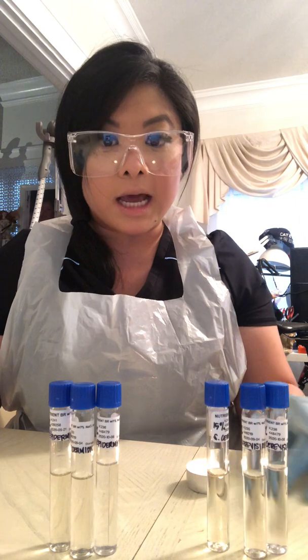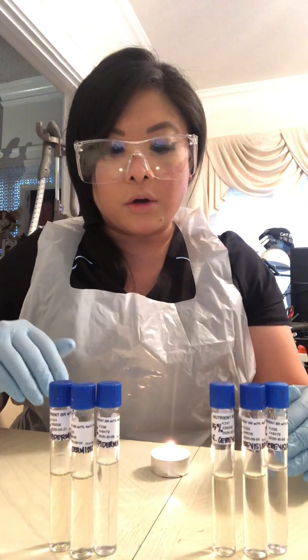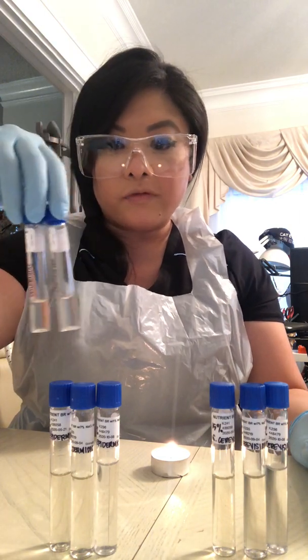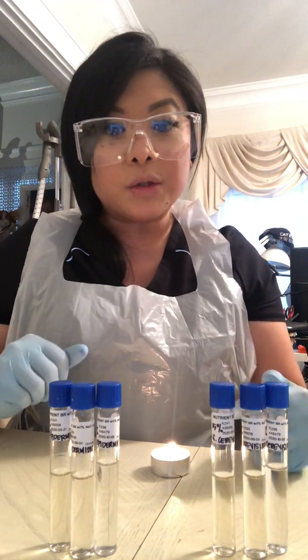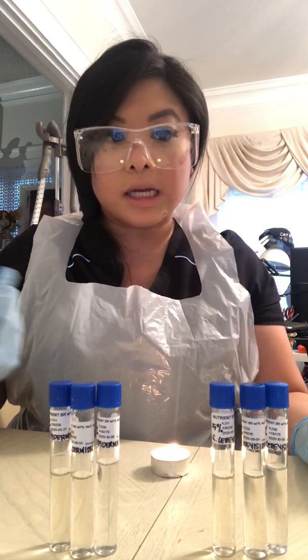How I will check for positive results is that I will check for turbidity in any of the broths. So that would mean it's positive. If it's clear, then it would be negative. And then my active cultures, I'm going to put them back in the refrigerator for future experiments. And that concludes my first experiment of lab of week 6 for salt tolerance testing. Thank you.